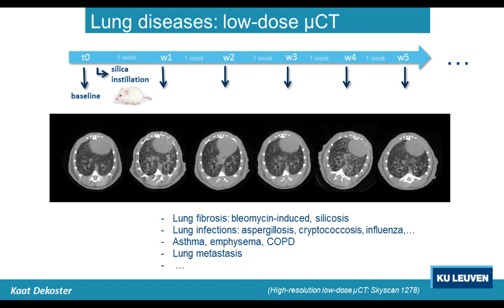And that is what we can do with low-dose microCT, and we can really demonstrate that this is valid to follow up all different kinds of lung disease. And I listed on this slide some examples that we have experience with. And so if this is applicable for your research, don't hesitate to ask me about it.